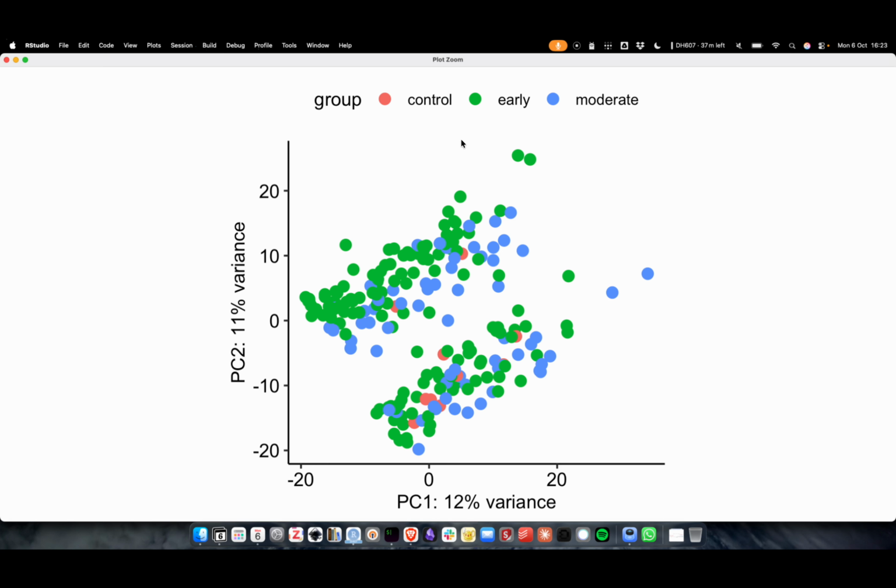So think of it as a dimensionality reduction tool. What is your original dimensionality? Let's start the question there. It seems like it's just an addition of an intercept. Okay, good. So there is definitely an intercept difference. PCA is not regression, but one way to think about PCA is regression. In other words, there are two sources of information seeping into your data, so there has to be something there.